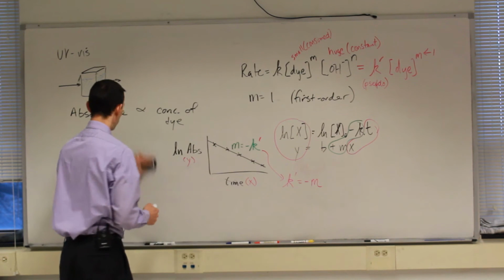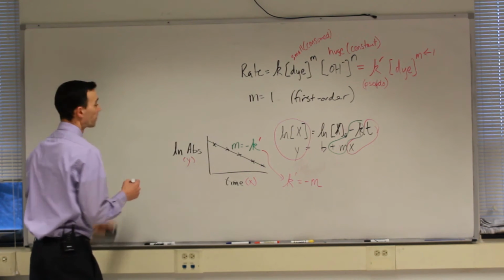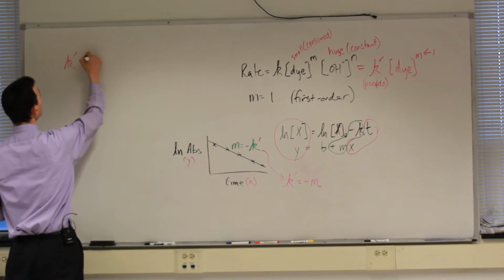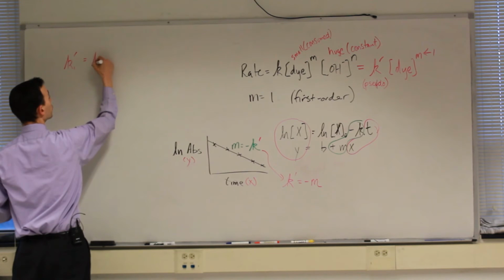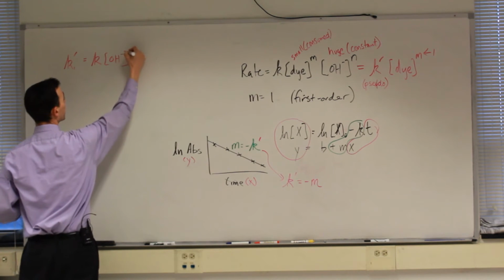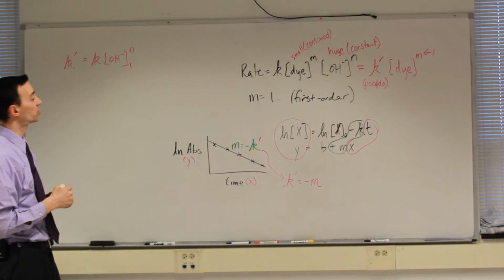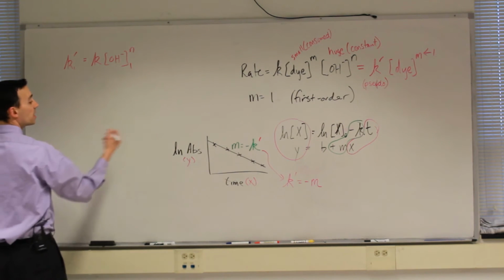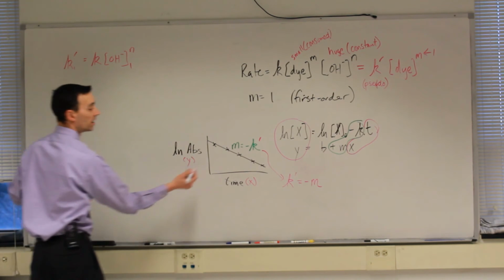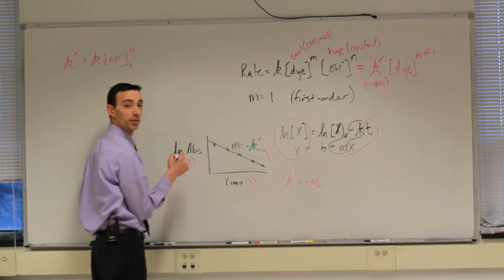For two separate trials of data then, from the first trial, k prime 1 equals the true rate constant times the concentration of hydroxide raised to its order that you used in the first trial of the reaction. When you repeat this for a second reaction, your second reaction will not have as steep of a slope, you'll see.